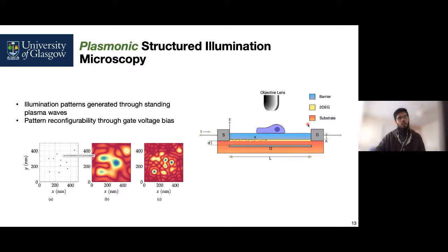One of the chief benefits of having plasmonic structured illumination microscopy, especially in the terahertz frequency domain, is that terahertz waves are non-ionizing to biological samples, which means that any exposure, as compared to optical frequency waves, would not harm those biological samples.